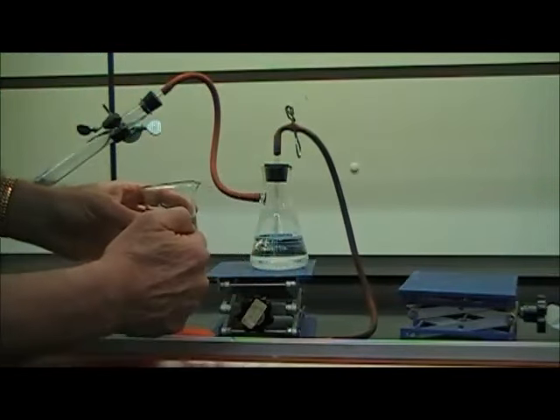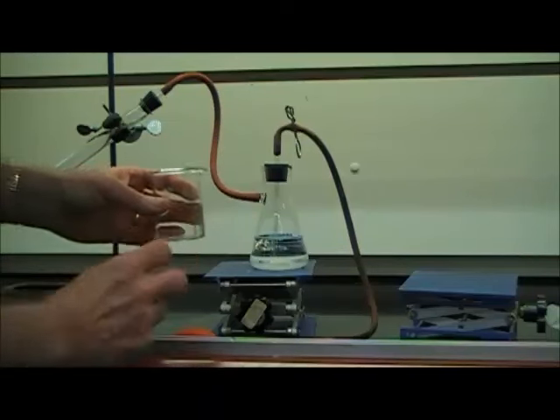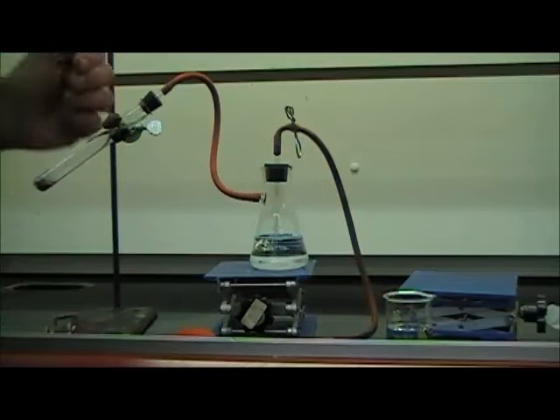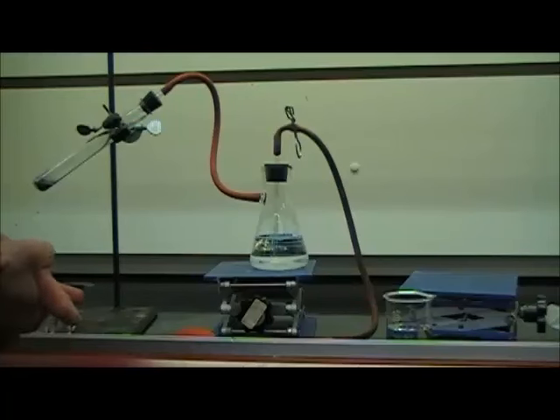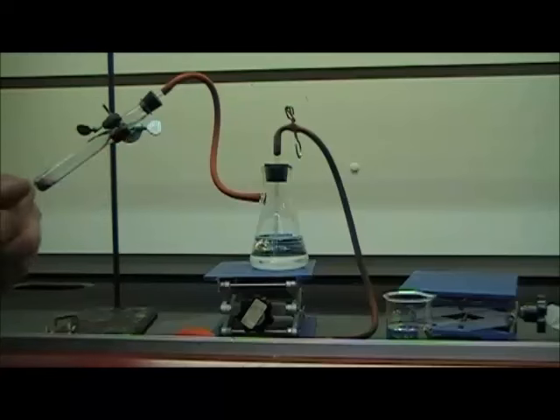So we're going to weigh this water or just put it in a graduated cylinder and see what its volume is. We're going to measure the temperature of the surroundings by just looking at a thermometer. We're going to measure the atmospheric pressure by using a manometer or possibly just looking it up online. And we're going to weigh the test tube. We weighed it before, we weigh it after, and the difference is the weight of the oxygen. With that data, we can calculate the value of R.